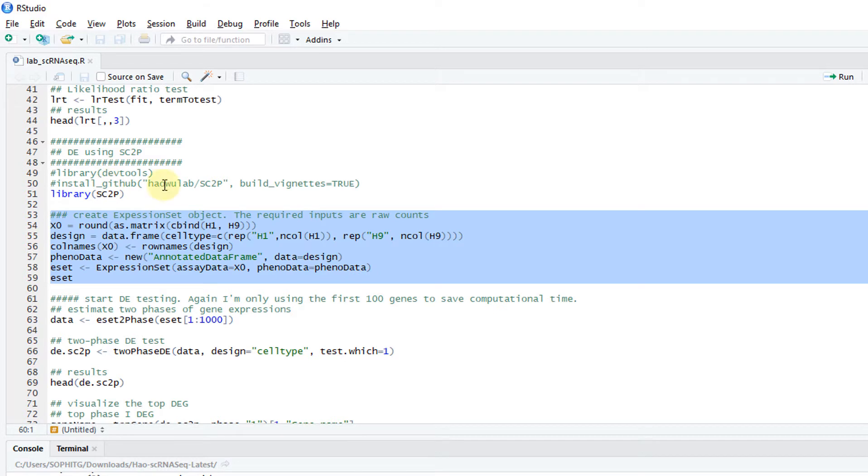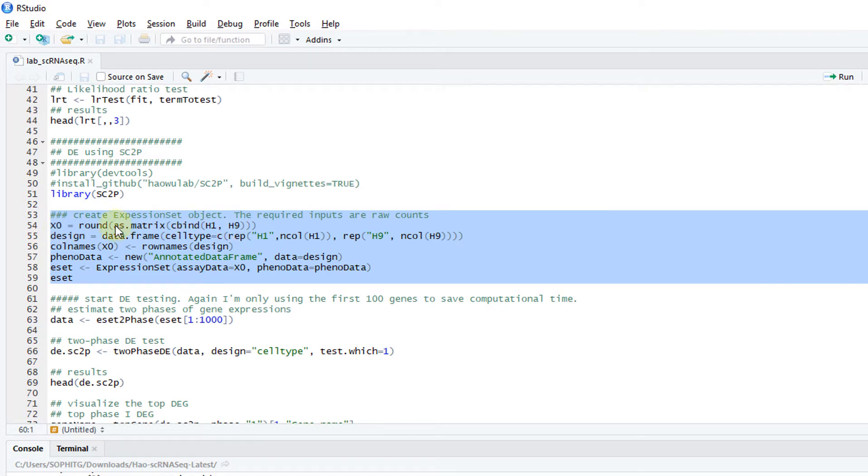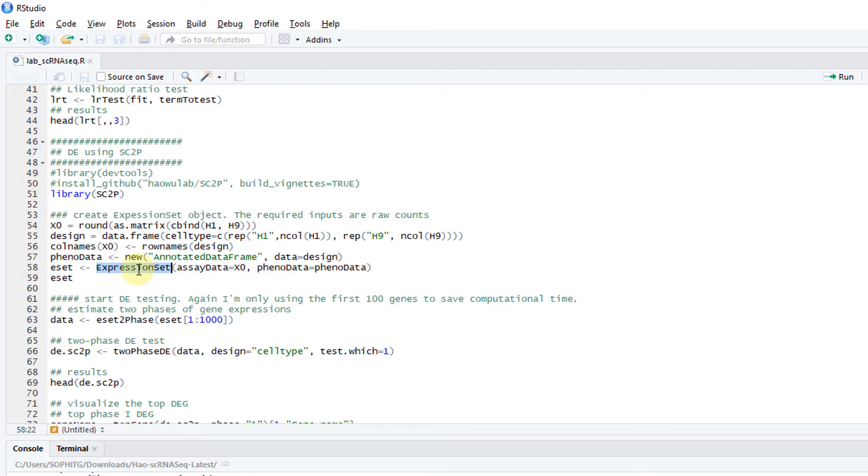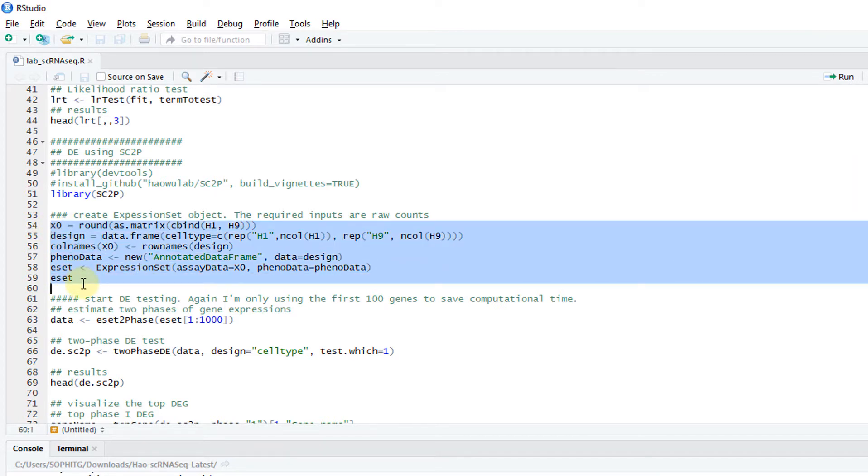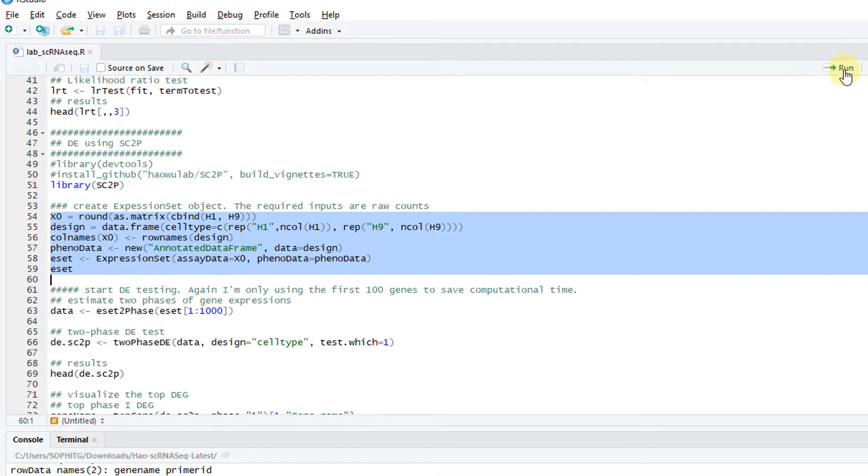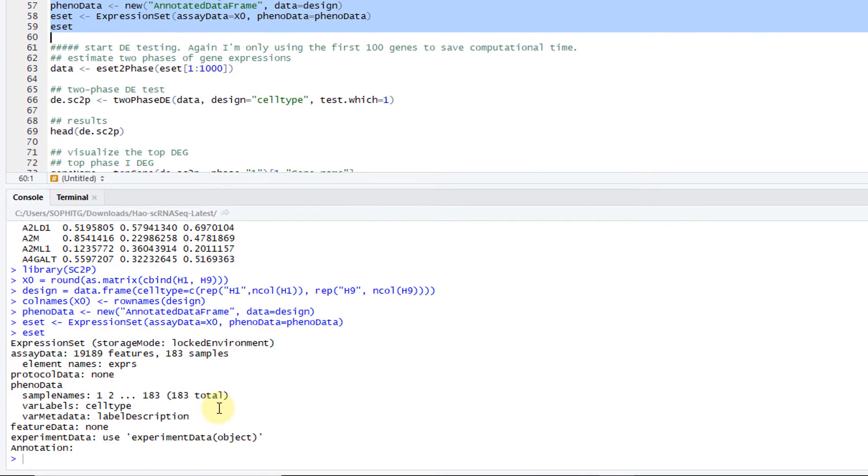In the beginning, the steps are very similar to using MAST. You need to have your count matrix. You create a design, basically tell the cell names. Then you create something called expression set, which is an object defined by Bioconductor in Biobases. I run this.